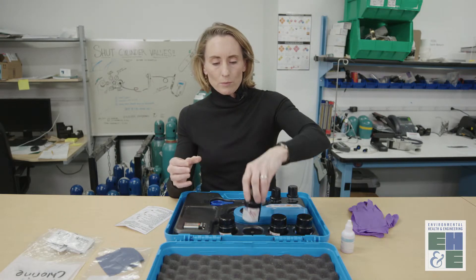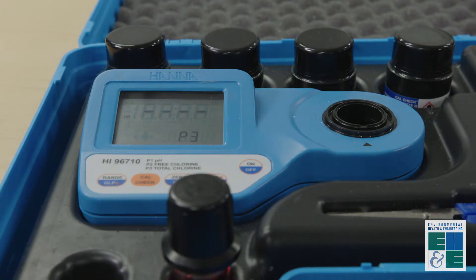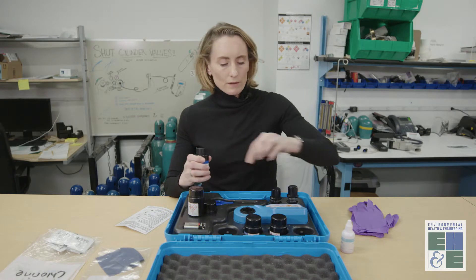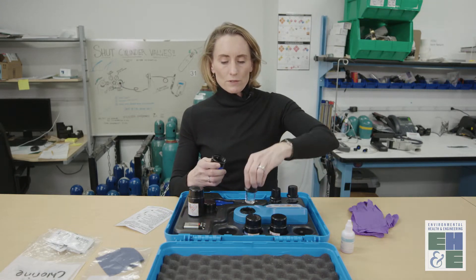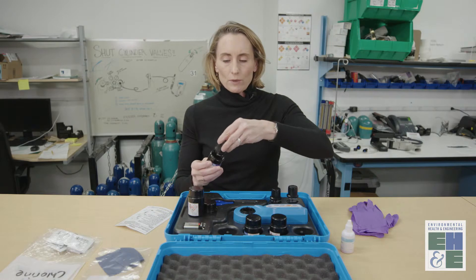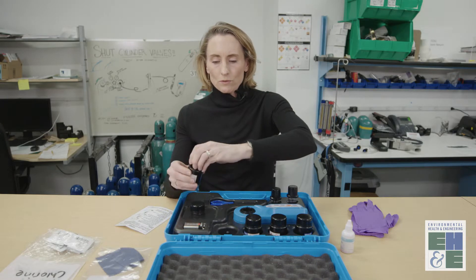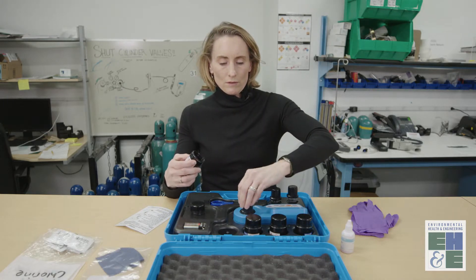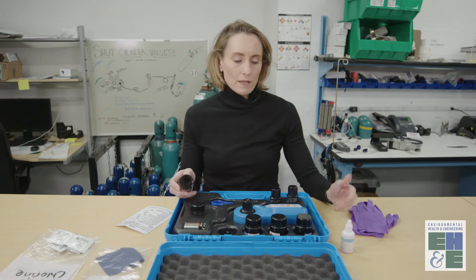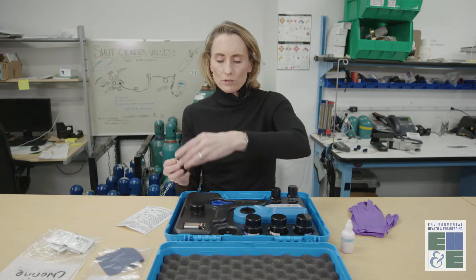I'll place that back into the container. Now I hit the range button — that will display P3, which is for measuring total chlorine. Again, I will hit CalCheck. It's asking for the zero. I line it up and hit zero — that's reading 0.0, so that's accurate. And again, we'll do the total chlorine calibration standard. Line the arrows up and hit CalCheck for total chlorine calibration. That's reading 0.99, which is accurate — 1.00 is the calibration standard value, and it's within range.